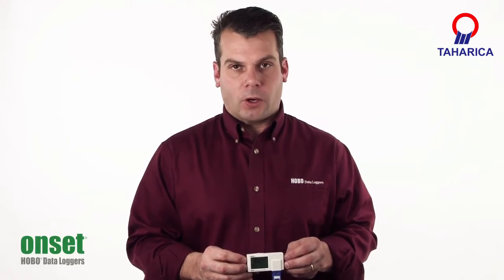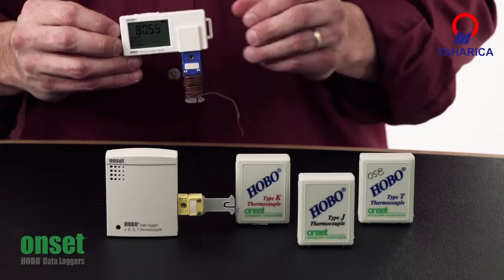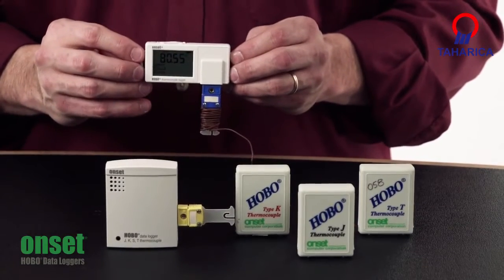Hi there, my name is Scott Ellis and I'm with the product marketing department here at Onset. We've recently released the UX100 thermocouple logger. This is going to replace a couple of our older loggers here — we have the H12 series and we have the U12 thermocouple logger.